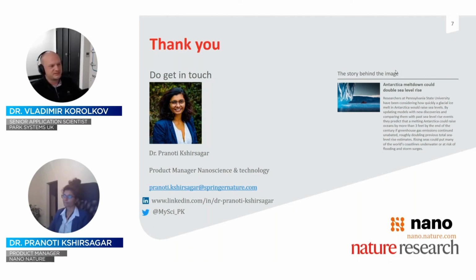Great, thank you for that again, Vladimir. Right, another question for you from Prashanth. How do proportional gain and integral gain contribute to an image?